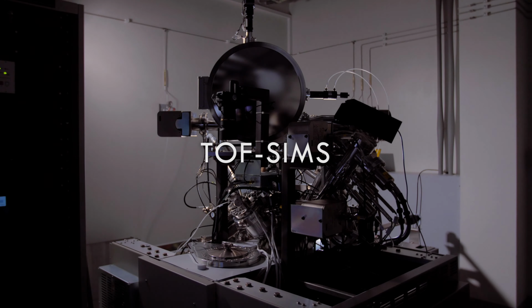ToF-SIMS data is collected by bombarding a sample with a pulse of primary ions, which in turn sputter part of the sample, generating secondary ions, which are pulled to the analyzer by an electric field. The secondary ion flight path has 3 electrostatic sectors which bend the ion trajectory, creating a long enough flight path to separate masses of the ions by flight time. Lighter ions arrive at the detector faster than heavier ions.